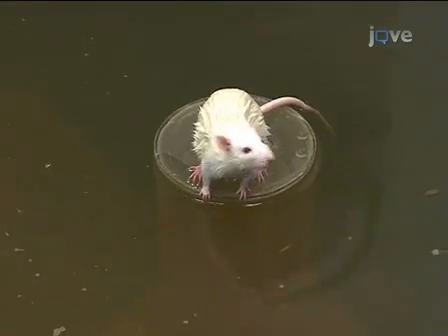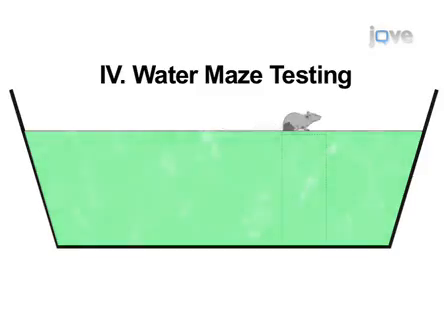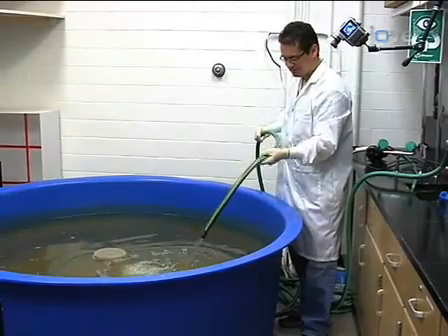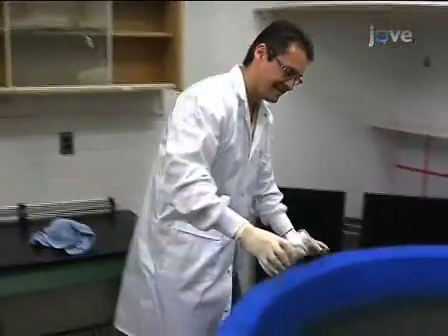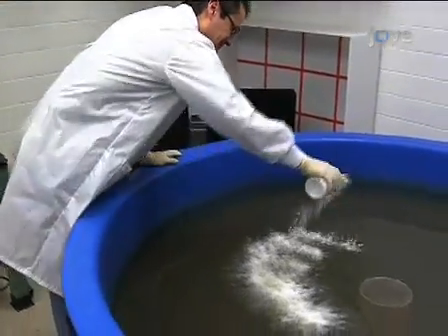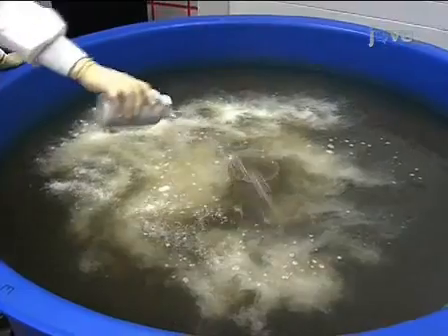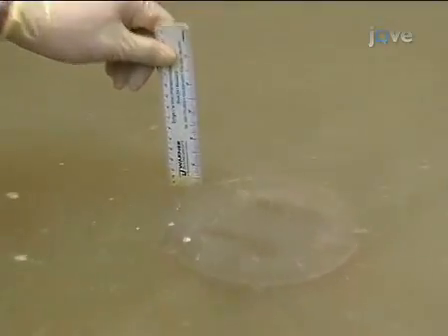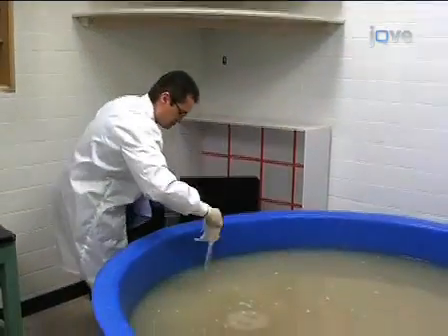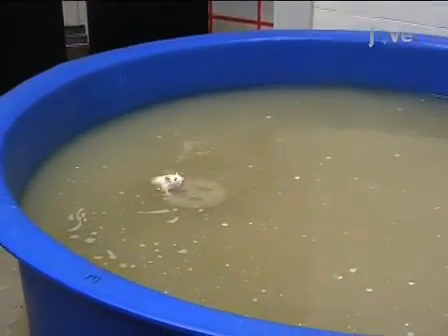Now that the animals are trained, they are ready to perform the water maze test. To begin the experimental trials, finish filling up the tank so the platform is about one inch below the surface of the water. Use nonfat dry milk or non-toxic white tempera paint to make the water opaque. The lighting and water temperature should be the same as in the training process. Each animal will undergo 12 trials, three from each starting direction. Each trial will last 60 seconds.